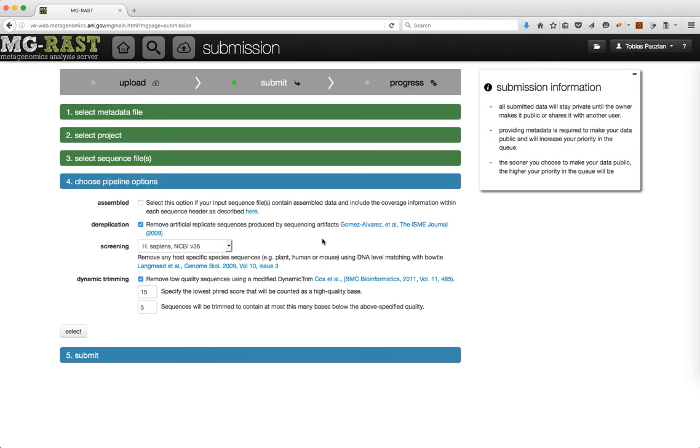Choose the options for the pipeline and click Select. If you are unsure about a setting, please leave it at the default.